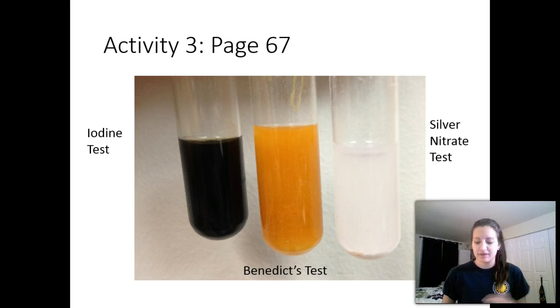If sugar doesn't leave the dialysis tubing, I expect that the Benedict's test results on the water in the jar will be negative. That's saying sugar stays in the tubing the entire time. It never enters that water, so we would expect that Benedict's test to come out negative. And then finally, if salt leaves the dialysis tubing bag, I expect the silver nitrate test results in the water will be positive. Again, salt was in the bag and it's leaving the bag into the water.